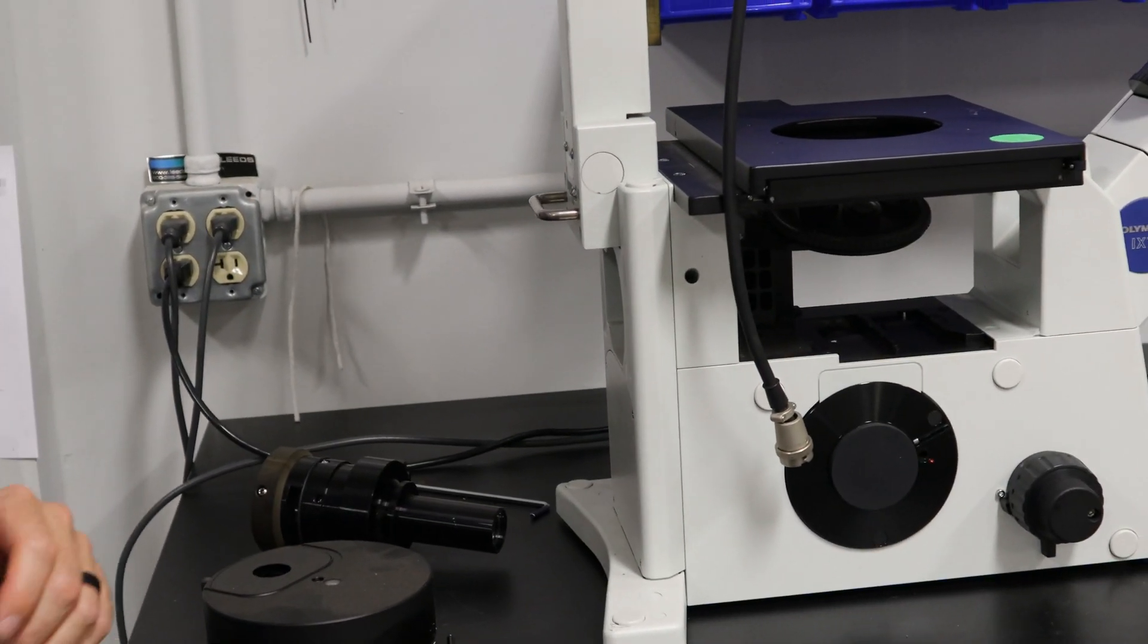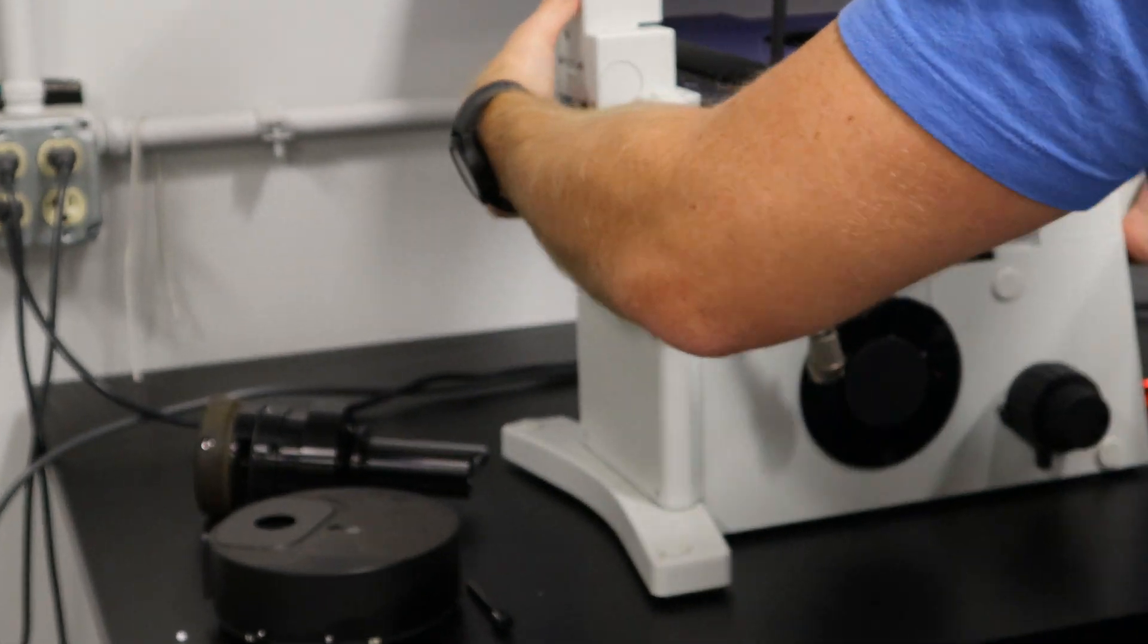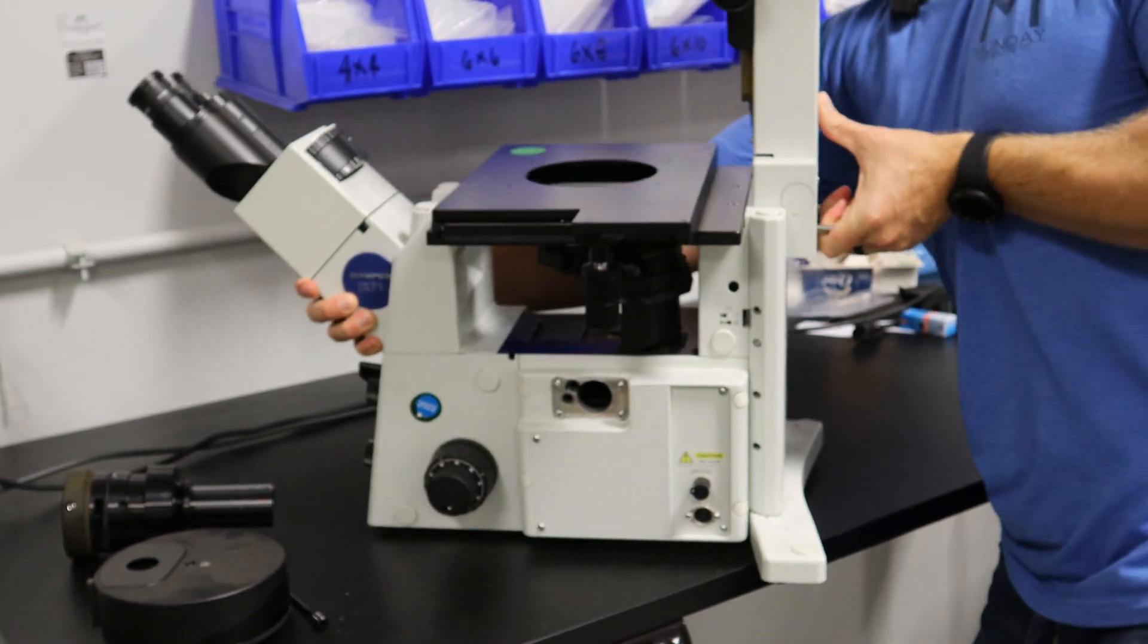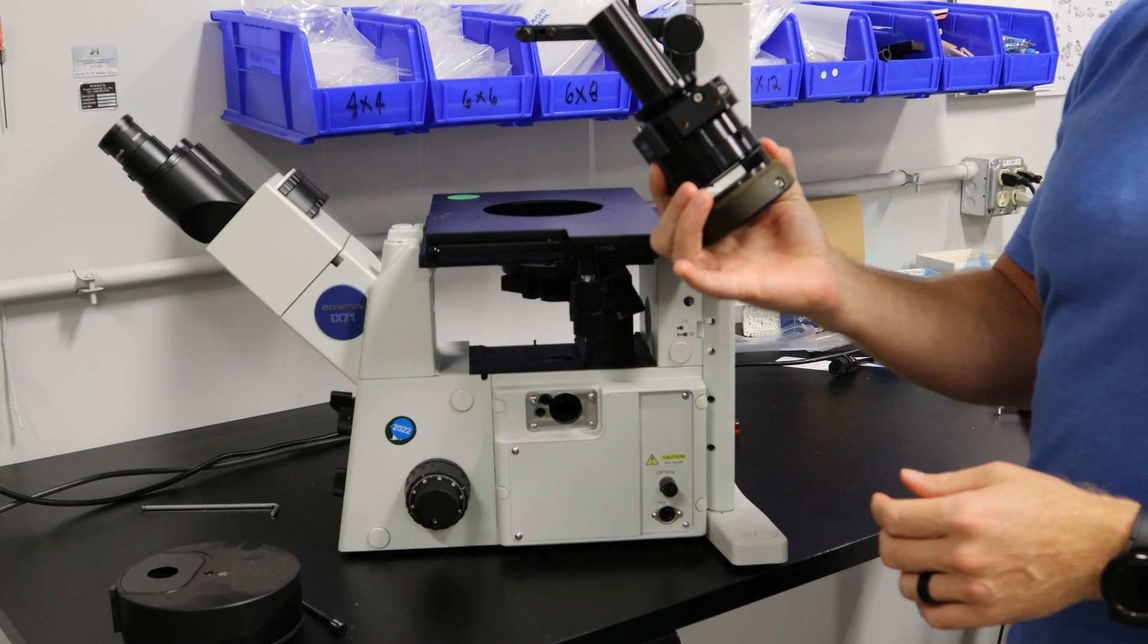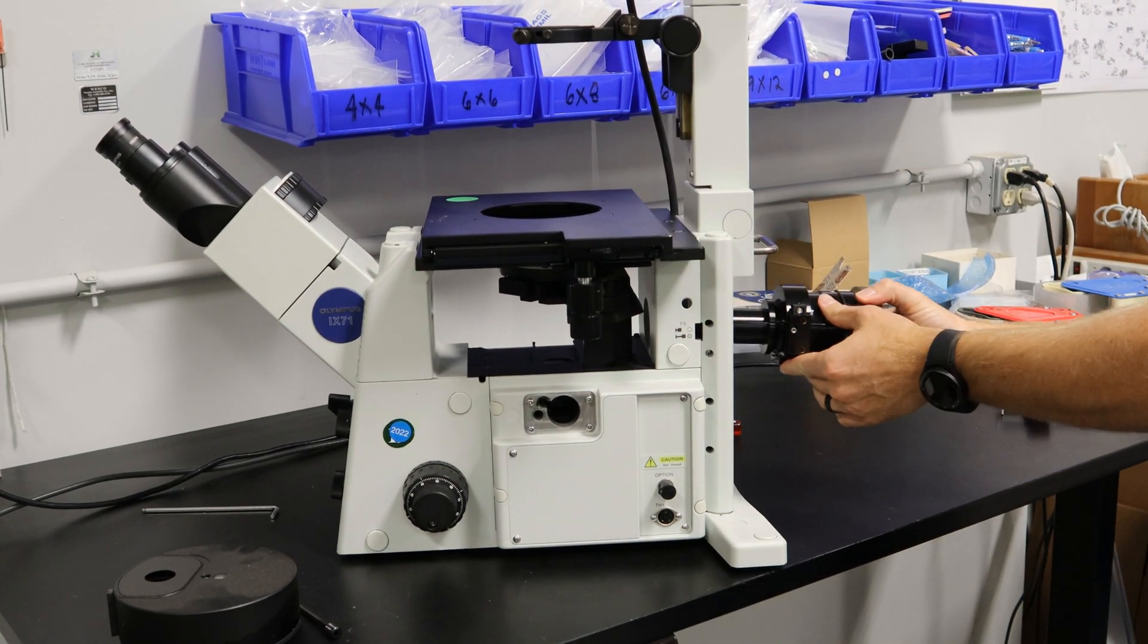Now we're going to put it all back together so you can see the assembly side. Right here, we've got the fluorescent illuminator. We're going to slide it in the back side.